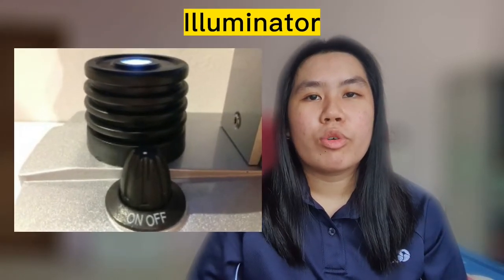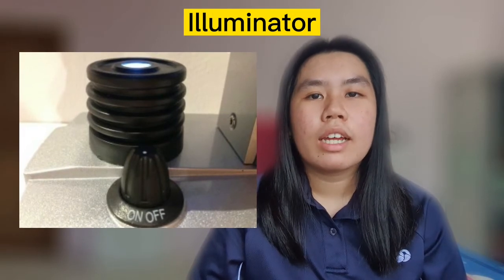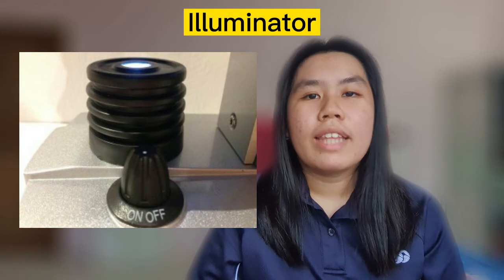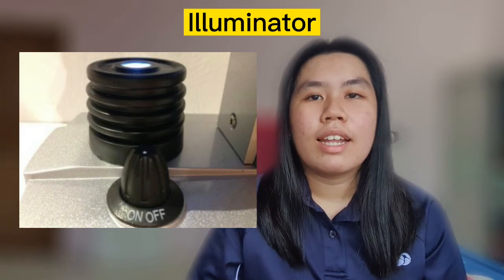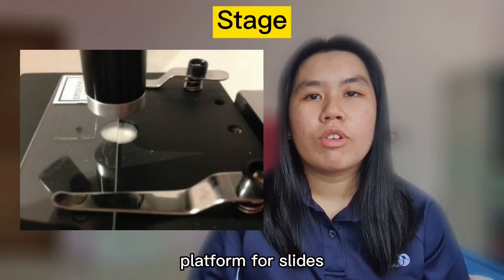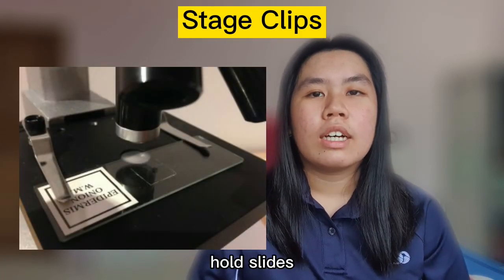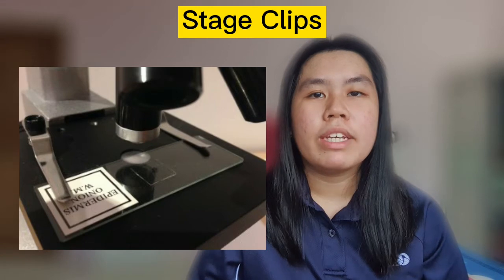The next part of microscope is illuminator. Every microscope requires light for viewing. This can come in the form of a low voltage illuminator or a mirror that reflects external light source such as sunlight. The another one is stage and stage clips. The stage is a platform for the slides which hold the specimen. The stage typically has a stage clip to hold the slide of the specimen firmly in place.